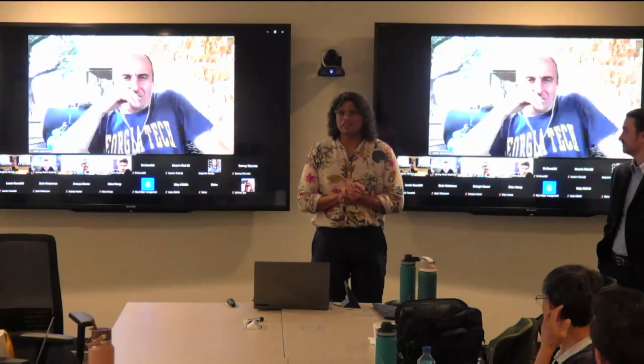So that brings us to chapter 5, encoding the cell phenotype with some really cool deep learning methods. Okay, so just a bit of context. Again, we're looking at phenotyping as a technique. Previously, we had talked a lot about genotyping. That's determining what genus or family or species an organism is. Phenotyping is determining what it looks like, and the same species or the same strain of something can have vastly different phenotypes, meaning it can look vastly different and still be biologically the same thing. Just like people can look totally different. So that's phenotyping. The workflow is to do this quantitatively because it is kind of a qualitative subject.